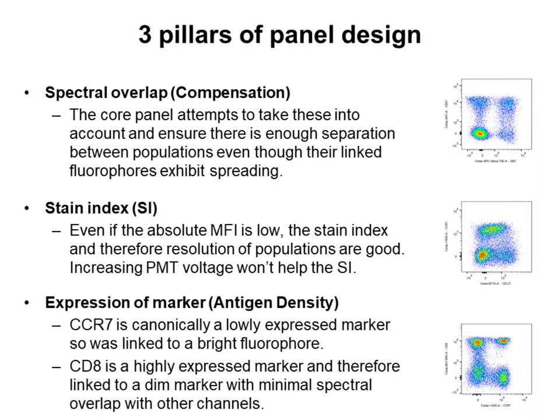and this is something that we can test each of us on every machine we have, the staining index for each of the channels we have available, using the corresponding dyes, and to ensure that even if the absolute MFI is low, the stain index and the resolution of population can still be good. And obviously the expression of the marker, which is the target of our studies. And we know some can be less expressed versus some others are more highly expressed.